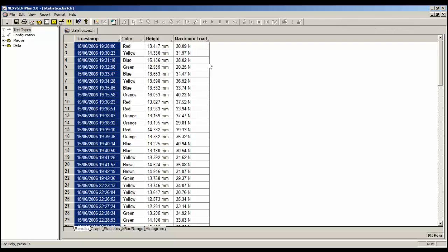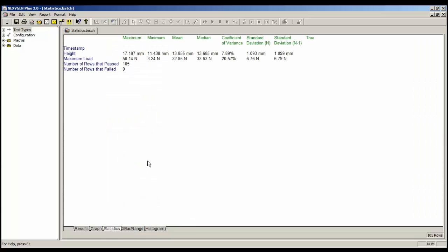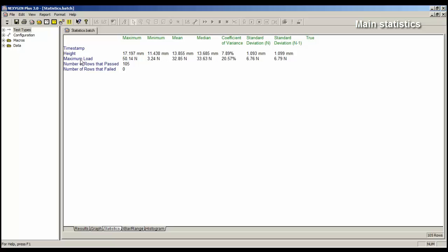Now let's look at the batch statistics. To do that, click on the Statistics tab at the bottom of the screen, and here we have the statistics. We have the main statistics of the maximum value, the minimum value, the mean value, and the median value for both the height and the maximum load results. The coefficient of variance, standard deviation n and standard deviation n-1, are calculated and displayed.